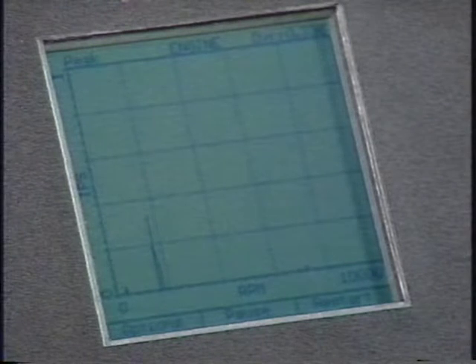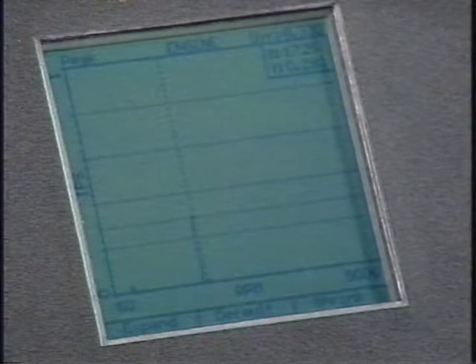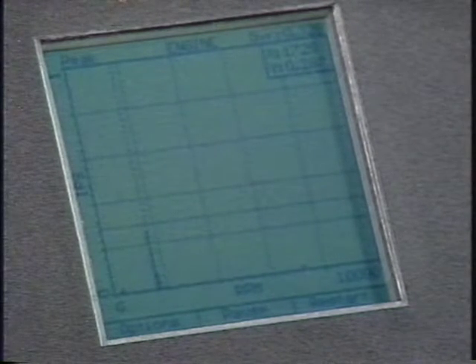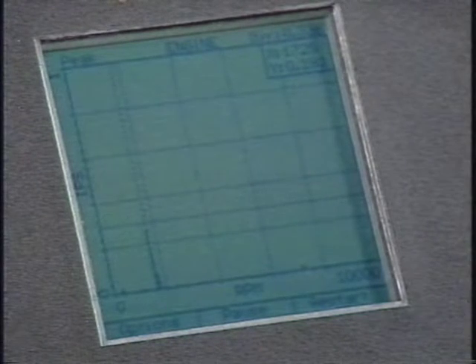Press the F1 key for Options, then the F2 key for X scale. The boxes change to read Expand, Default, and Shrink. Press the F1 key corresponding to Expand, and the X scale of the spectra enlarges. The three boxes at the bottom of the screen automatically revert to the original three choices: Options, Pause, and Restart.